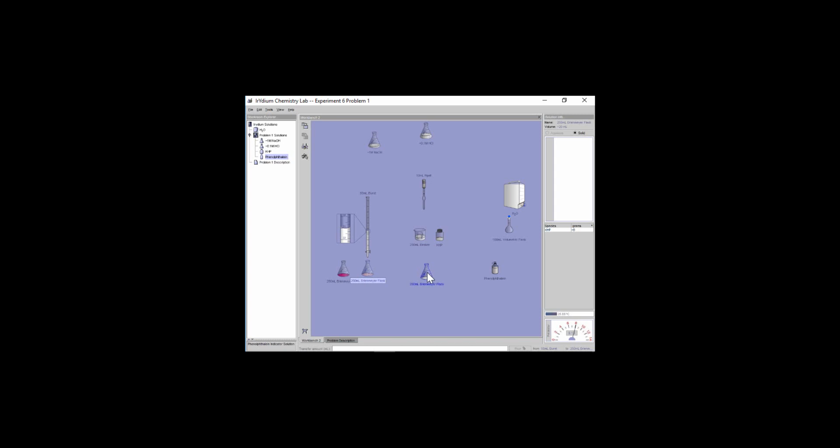Because I did have a third trial set up, let me just do one quick calculation. How much volume did I toss in there? 31.03 minus 21.26. I tossed in 9.77. So for my next trial, again, I know I'm safe with at least 8. So I'm going to have my third container out. I still have enough solution in my burette.